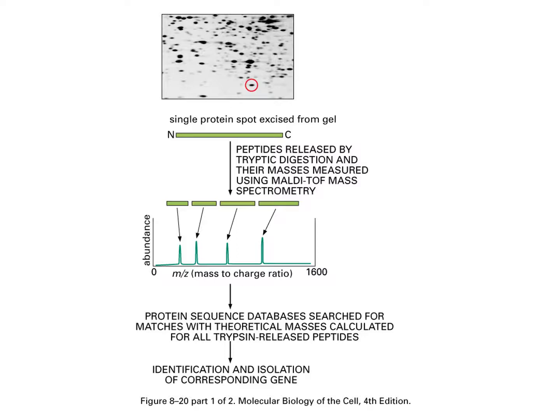So I can look in a protein's gene, okay, a gene, and then here is the protein, okay, and then every place that a trypsin could cut, we could get a fragment. So theoretically, you can take the whole human genome and in silico, in the computer, trypsinate it and get fractions and a protein fingerprint.